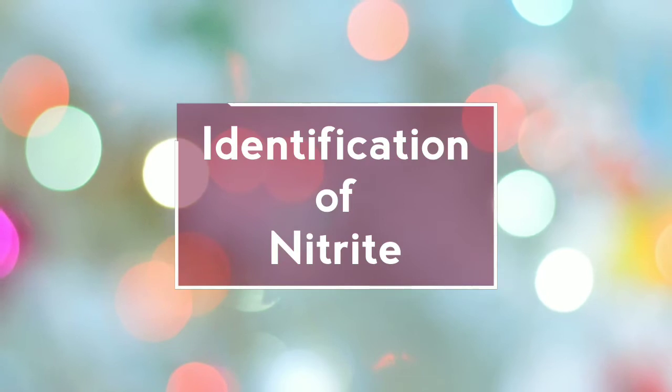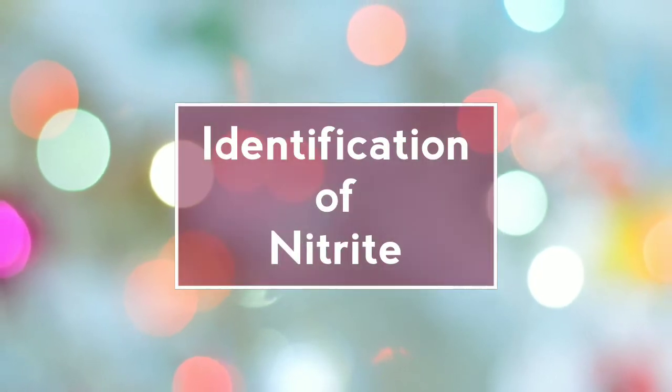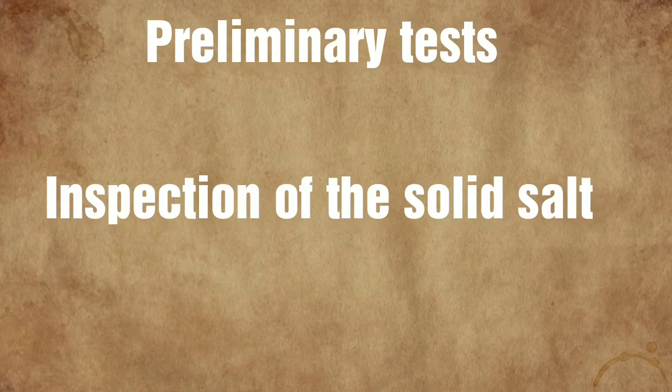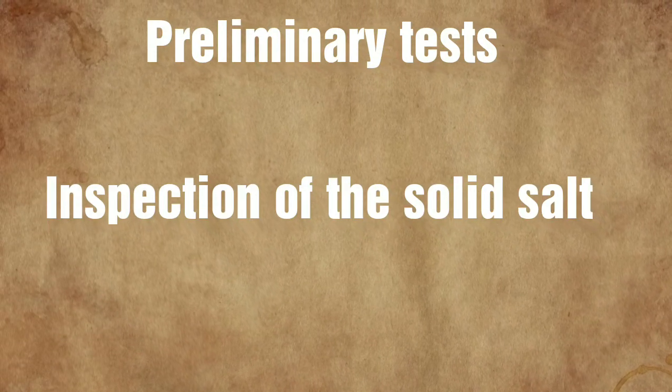Hello friends, today we will be doing the identification of nitrite anion. Preliminary test: inspection of the solid salt.